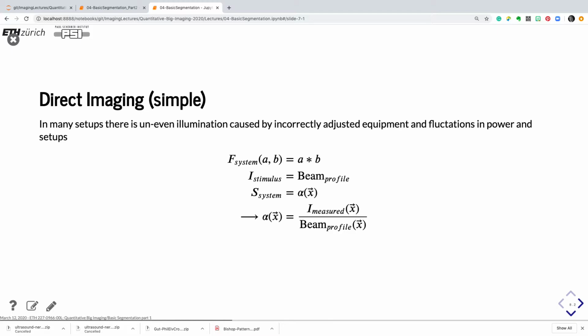Or attenuation image, actually. The reason why I say attenuation image is that the beam is not always, well, no, it's a transmission image. Sorry, I'm messing it up this morning. The attenuation is something that happens to a certain part, but you have different reasons why the beam is not reaching the detector. So you only talk about the transmitted beam.